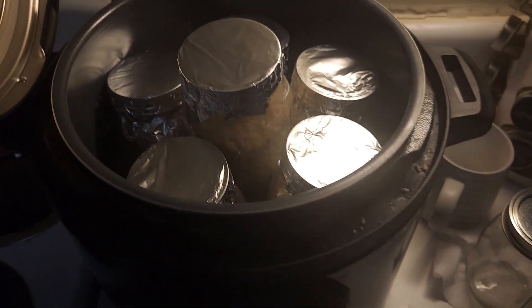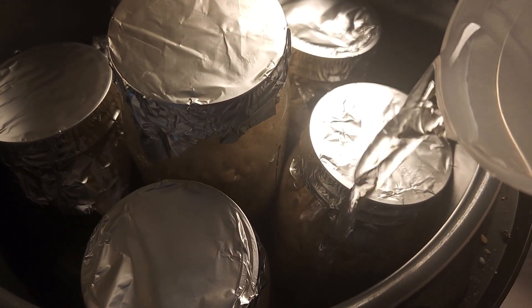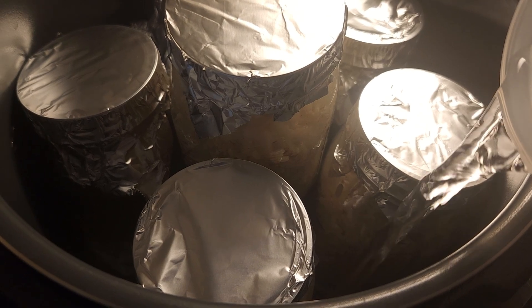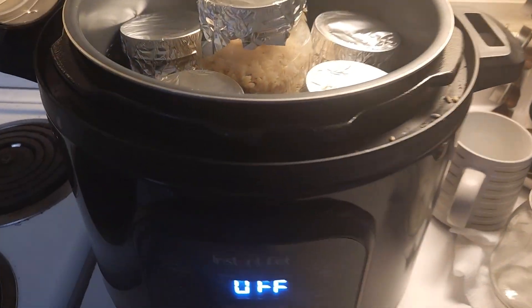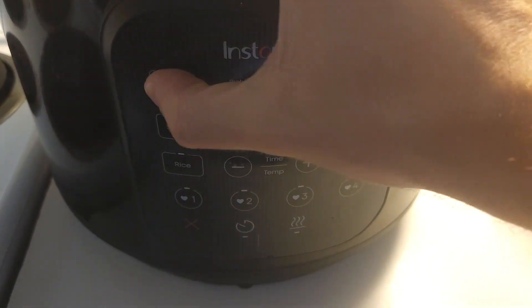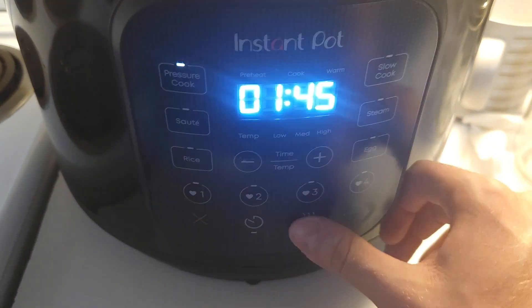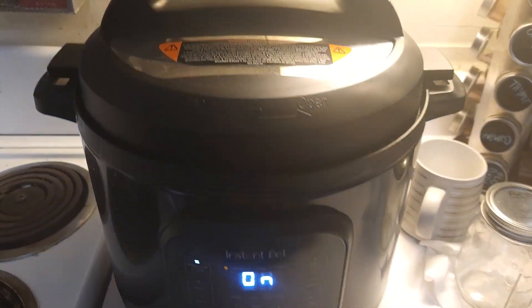With everything loaded up into our Instant Pot, we're going to go ahead and add just enough water to cover the bottom and maybe about half an inch to an inch up the jars. We can go ahead and seal the Instant Pot and pressure cook — I'm going to do 45 minutes since I have so many items in there. We'll keep the keep-warm off, start it, and for the first 10 minutes after we build heat we're going to keep it on vent to steam, then move it to pressurize.